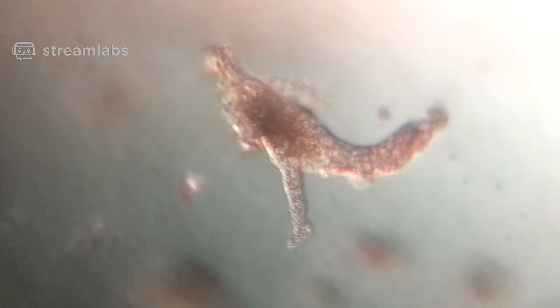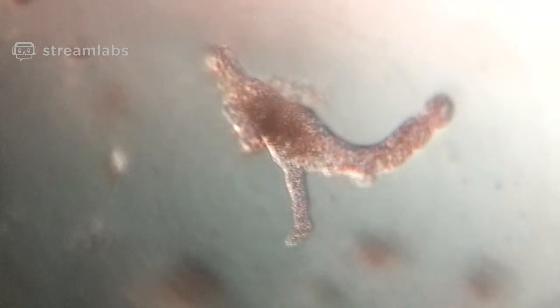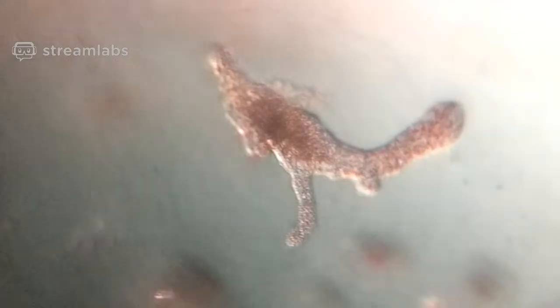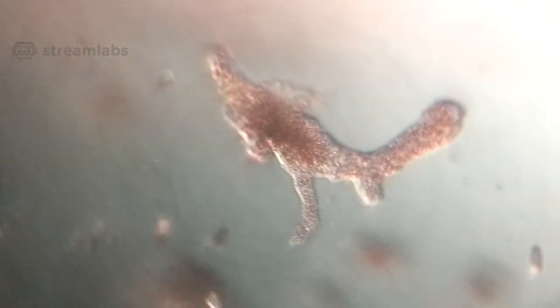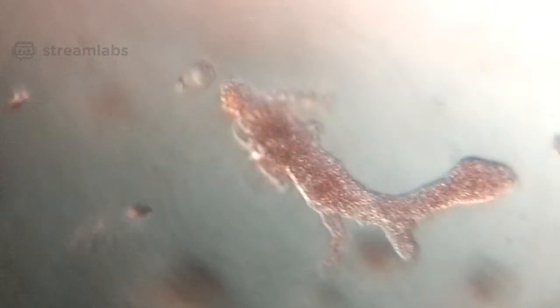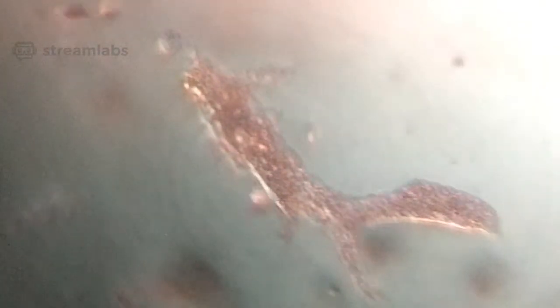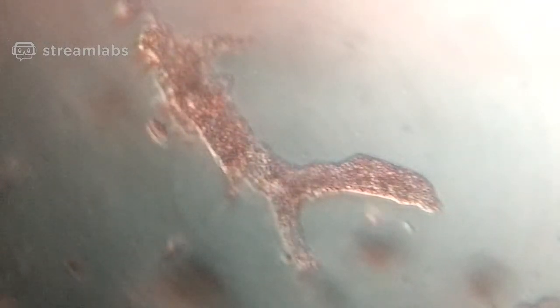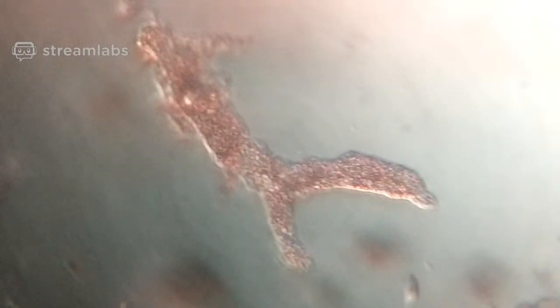If you are lucky today, it's actually hunting for Chilomonas. We might get one capture. Okay, so I'm giving myself another maybe 10 seconds. You can see the streaming. How beautiful is that? How beautiful is the streaming? Amazing. Okay. Well, I can go on, but this is only a workshop. But you know what? Once you get an amoeba, you don't let it go. I'm going to hang on to this slide till after the workshop, and I'm going to be looking at this forever.